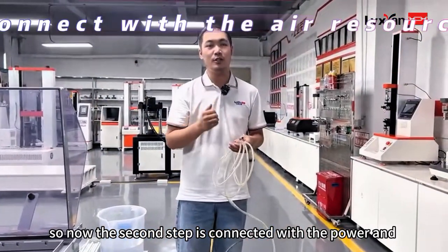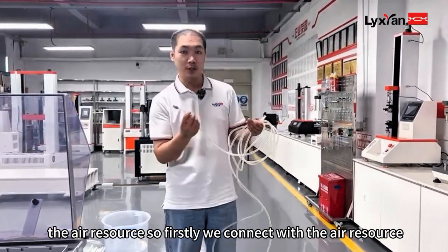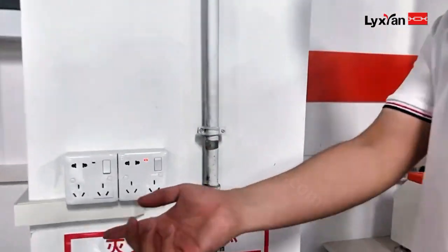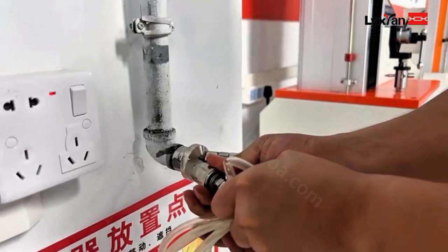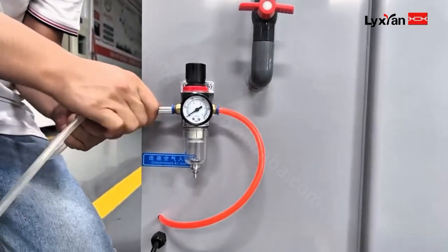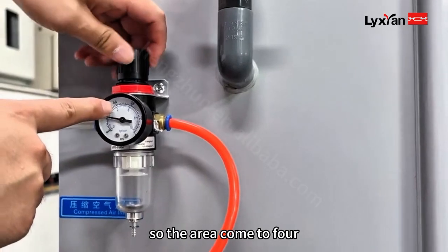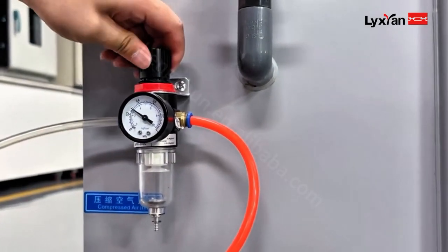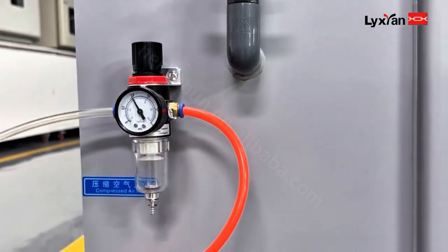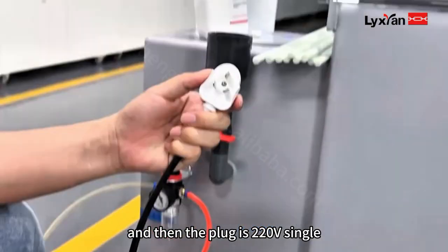The second step is to connect the power and air resource. First, connect with the air resource. The air pressure comes to 4 bar. Then plug in the power.